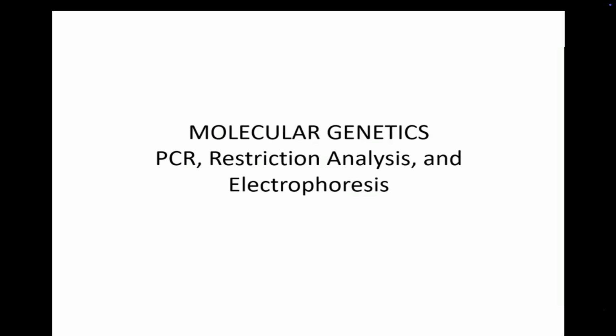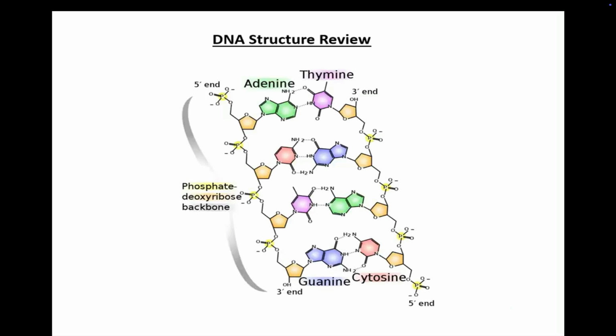Today in lab, we will be talking about molecular genetics, specifically the techniques of PCR, restriction analysis, and electrophoresis. Let's begin with a review of DNA structure.